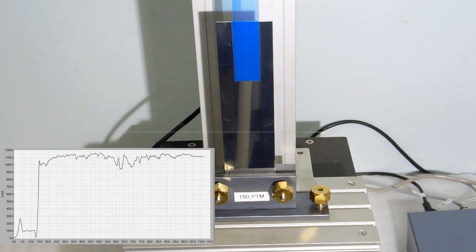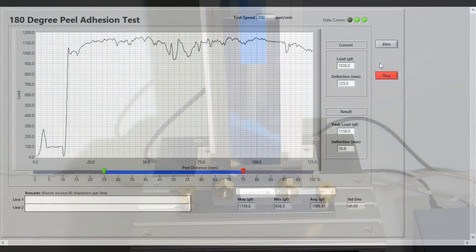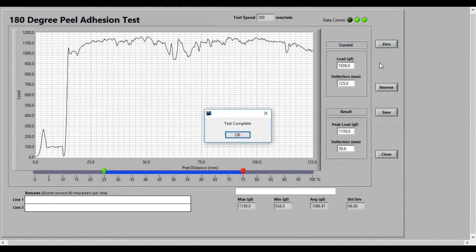After the test is complete, the machine will stop and the software will show a test completed sign. Select OK. You will see a slider under the graph. Try to select a flat portion from the middle of the graph, neglect the starting of the graph and a little bit from the end as well. Your statistical calculations will be made from this portion of the graph.